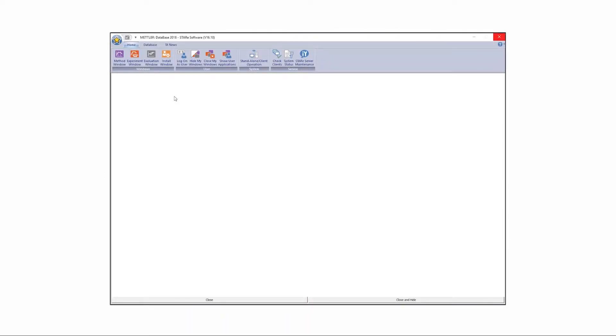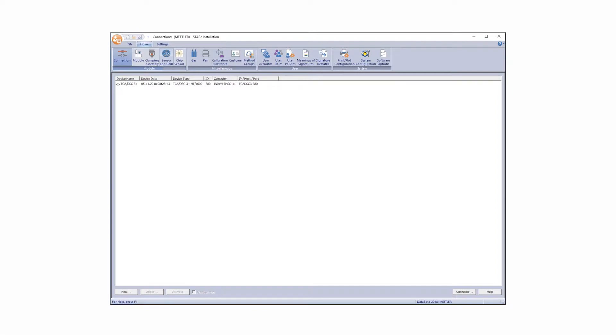First, to establish a link between your Mettler Toledo balance and STAR-E software, go to the Install window in STAR-E and, under Connections, click New.